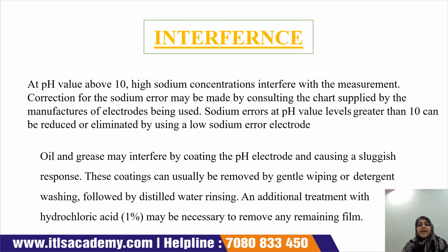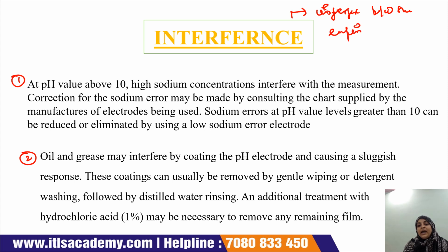Now the next is interference. Here there are different interferences. This is your first interference and this is your second interference. Interference means that which interferes with the experiment and affects the result.